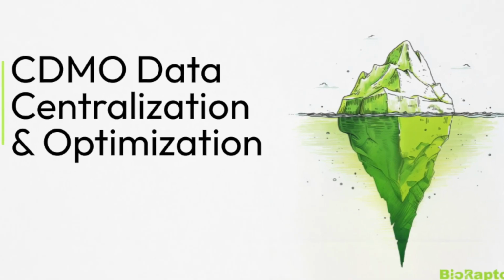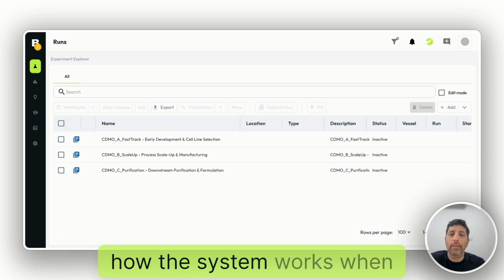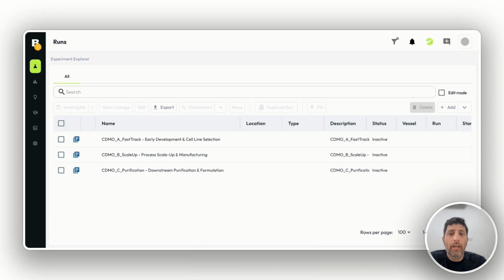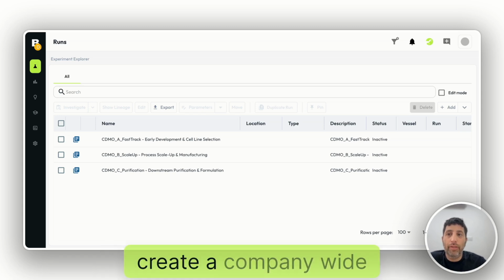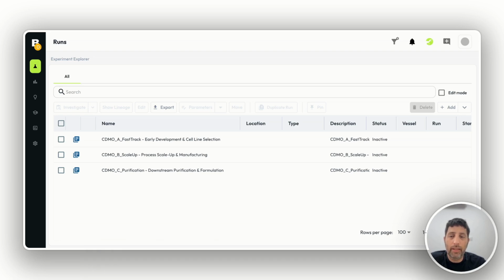Hi, everyone. I'm Yaron, I'm the CTO of BioRaptor, and today I wanted to show you how the system works when you're working with multiple CDMOs. How you use the system to create a company-wide knowledge base, analyze data, and get insights.